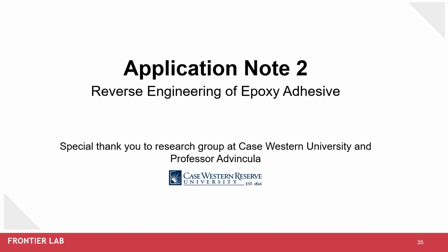So before we have the webinar question and answer, I would also like to go over another application note pretty quickly. This is a short one, and it is about reverse engineering of epoxy adhesives. A little bit of background.